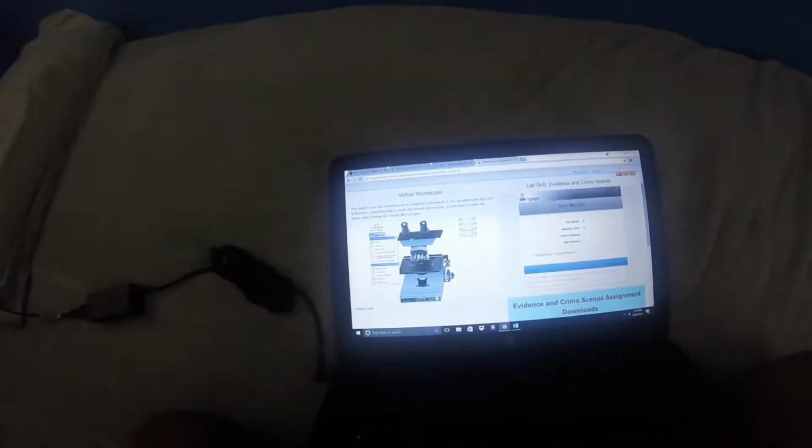Switch views so that you're looking at the microscope. Okay, switch views, looking at the microscope. Remove the letter E on the slide and select the cheek smear slide on the right of the page. So remove the letter E and the cheek smear. Place that on the thing. Manipulate the stage so that the sample is over the light source. Okay.